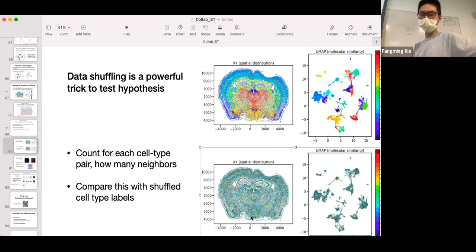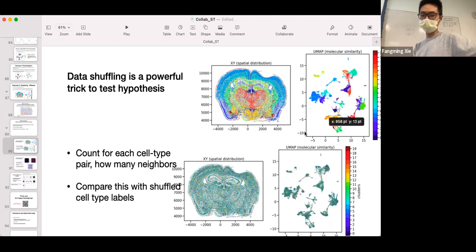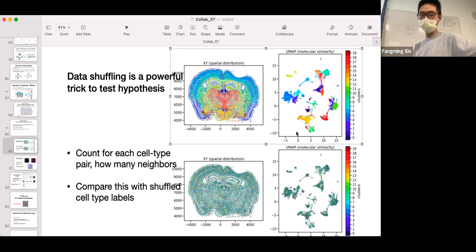So to visualize it, it's the same number of clusters, both 20 clusters, right? But the bottom one is where we reassigned every cluster randomly so that the brain is a homogeneous brain. You kind of dissociate every cell and rearrange them. But now it looks like this, and you can repeat this a lot of times, 1,000 times, if you will, and compare the random versus the actual data and see where each cell type pair lights up.